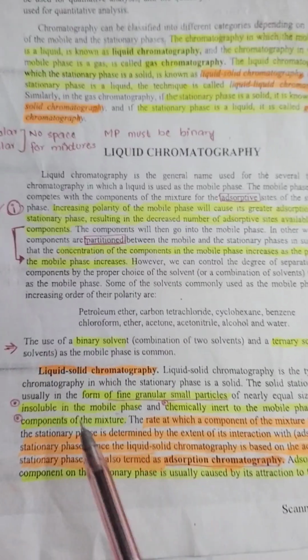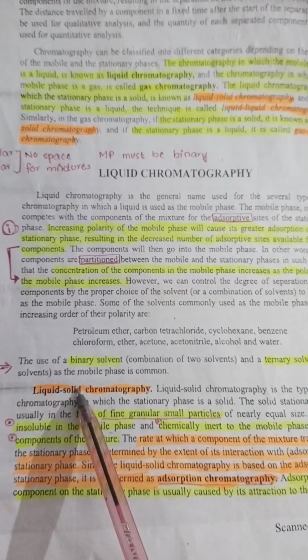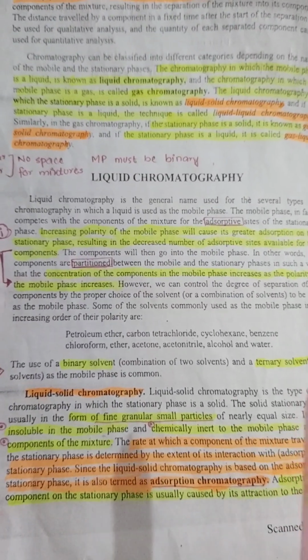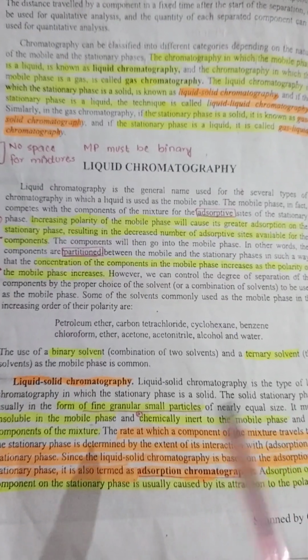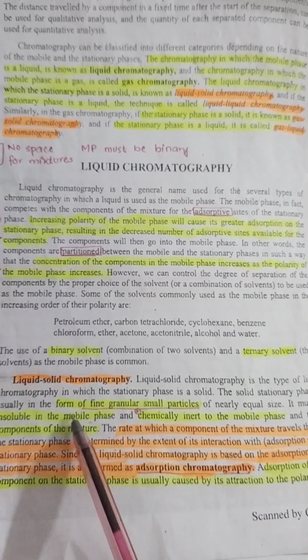Okay, now we discuss liquid-solid chromatography, in which there is a liquid mobile phase and a solid stationary phase, and it is also called adsorption chromatography. In it we take a solid stationary phase in the form of fine granular, smaller particles.